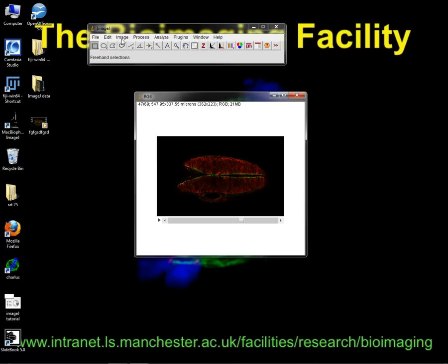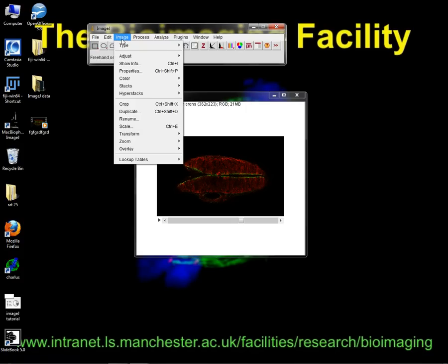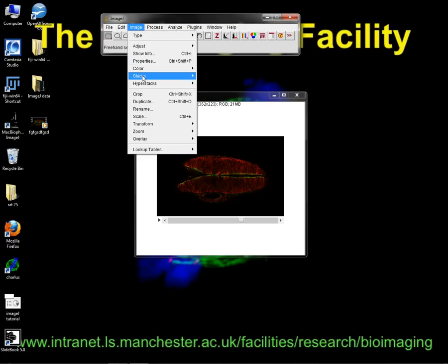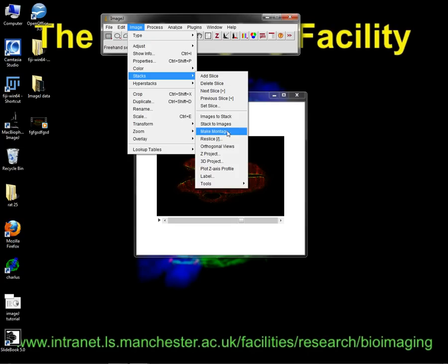The other thing you can do is, well, it's kind of hard to show a Z-stack in a thesis. So one option would be to save your AVI as a DVD at the back of your thesis, and maybe show representative images from the Z-stack as a nice little montage. Okay, again, you're like, oh, blimey, how would you? Sounds complicated. Actually, really easy. Under the Stacks tool, you can make a montage.